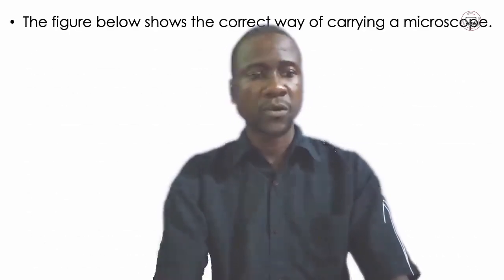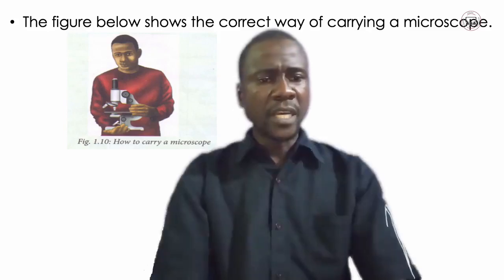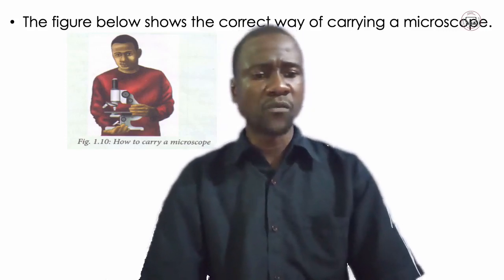Now, we have just learned that a microscope is a machine that we may use in the laboratory, and we have just seen the parts and their functions. But now, assuming you want to carry that microscope to another place, how can you carry it? The figure below shows the correct way of carrying a microscope. Here there is a person who has carried a microscope, and that is the proper and correct way of carrying it.